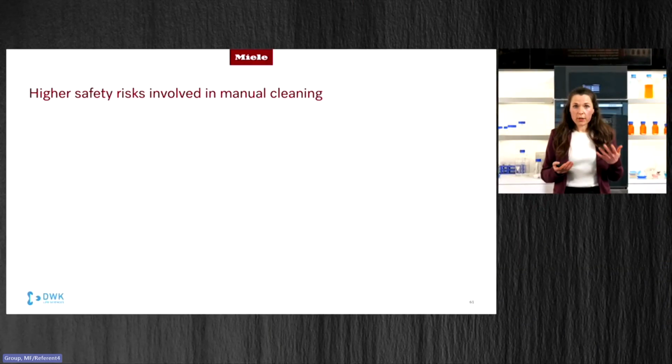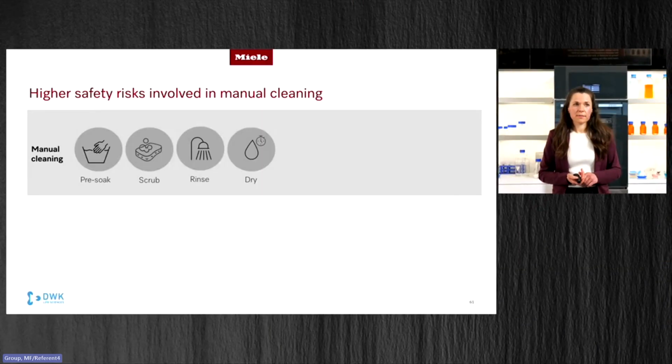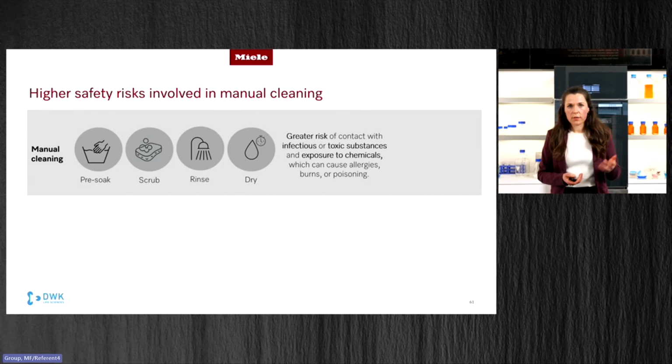Let's take a look at the safety aspects. In manual cleaning, we have several steps: pre-cleaning, scrubbing, rinsing, and drying. At every step, the individual doing the cleaning is exposed to possibly toxic or infectious contaminations from the residues in the glass, and to the process chemicals for cleaning the glassware.